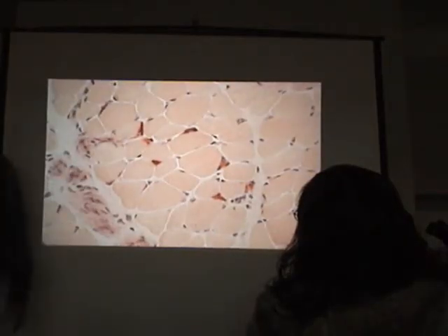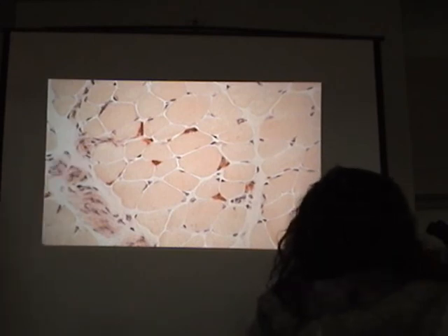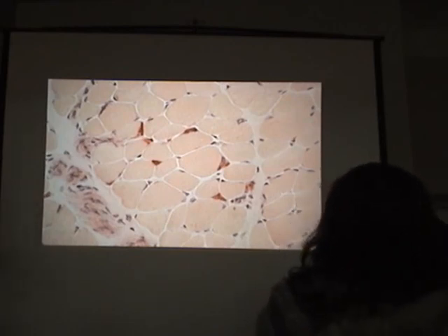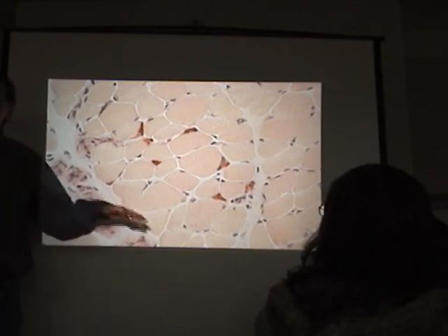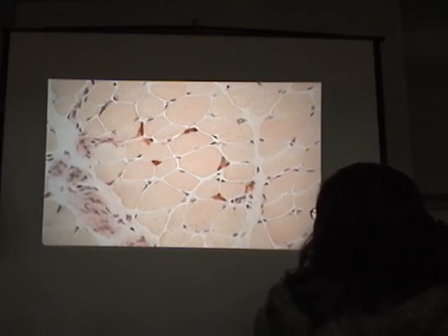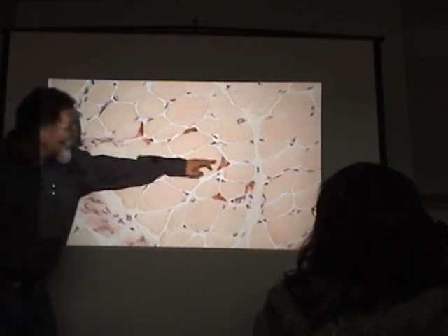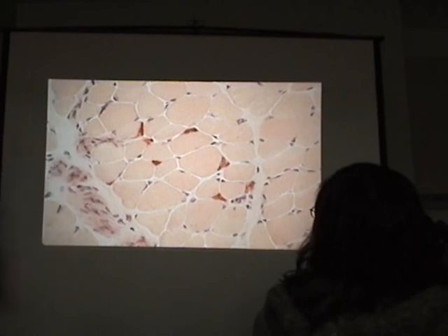This is a histochemical stain for cholinesterase, all right? If you think about it, the neurotransmitter is acetylcholine, and once you've released it and it's bound to its postsynaptic receptor, you want to get rid of it. Otherwise, if you inhibit cholinesterase, you have a nice insecticide. A lot of insecticides are cholinesterase inhibitors. So basically, the organism just goes into tetany, and that's that. But this stain is for that enzyme that breaks down the acetylcholine, and therefore it's a nice marker of motor end plates. So you can see that you've got motor end plates in all the regions where you've got that beautiful scarlet stain.